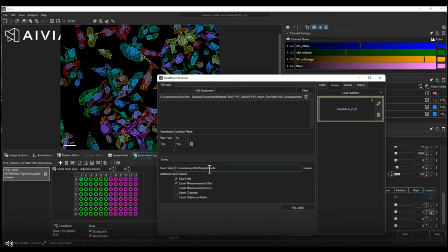In this example, you're going to recognize that there's a number of different options for export functionality. There's the option to export into Excel. There's an option to export into the CSV file format. That second format is quite important downstream if you want to export it out to another analysis software that you may interface with. In our example today, I'll be using Cytomap as an example to perform advanced analytics. So I'll choose a CSV function there. Moving on to the editor.